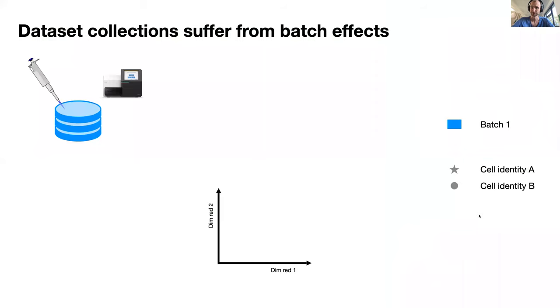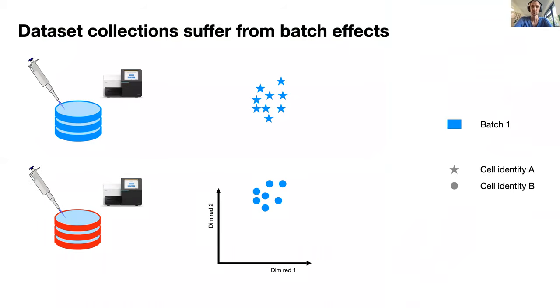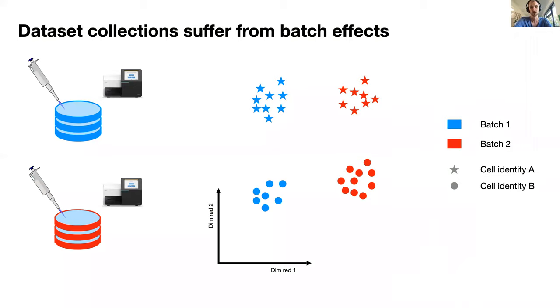Let's take a step back. If a dataset is generated at one point and you process the data, you perform a latent space embedding of this, you see your cells typically looking somewhat like this, separated by cell identity, and looking kind of nice if it works. Now, if you perform a second experiment, or if a different lab does this at a later time point, typically you do the same thing and you want to embed the data in the same space, but you see that cell identities no longer match but are separated by what we call a batch effect.